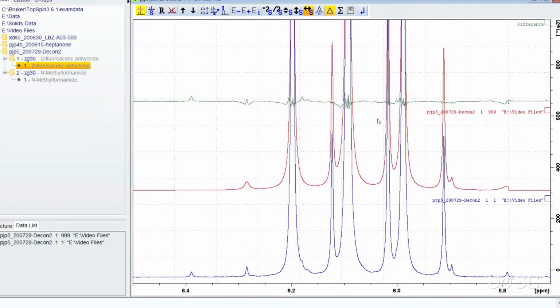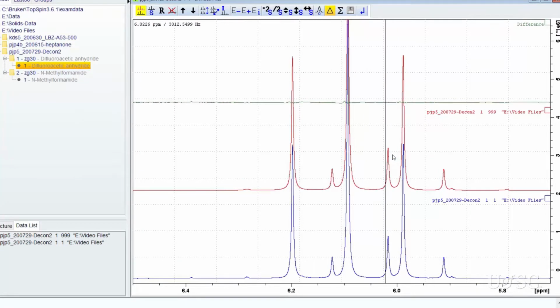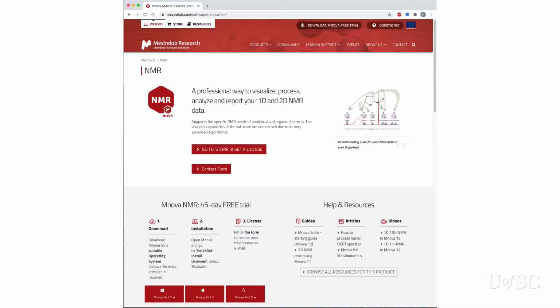The routine in Topspin has some issues but it can yield very good results. It lacks some control of the starting input and it will not optimize the Gaussian to Lorentzian shape ratio, so you have to manually make changes and rerun the fit. The deconvolution routine in MNOVA is superior to Topspin and we recommend it if you have a lot of spectra to simulate or if your spectra include broader line widths.